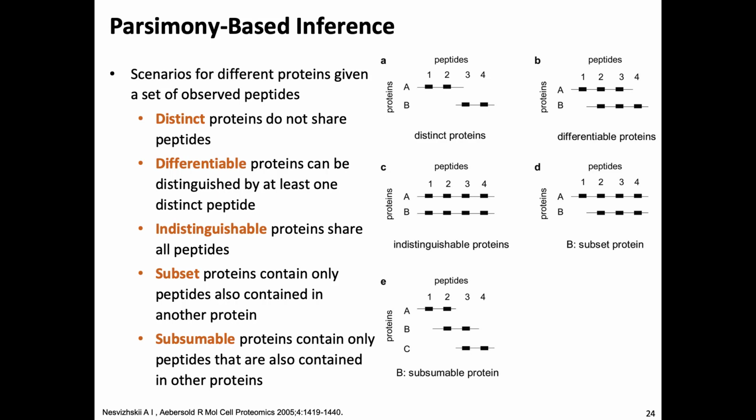Say again? If you see A, you know it's not B. Yeah, if you see A, you know that A is present, but what do you know about B at this point? Yeah. You cannot do that with qualitative proteomics. You need to go to quantitative proteomics, and you can start comparing ratios. We'll talk about that in a minute. It's not that trivial.